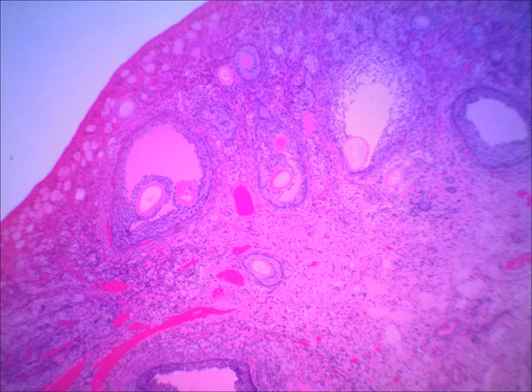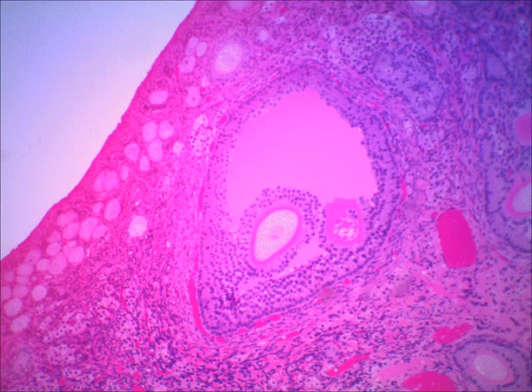The most mature of all of these follicles that you see here would be, let me erase that, I'm sorry, would be this one. All right, so that's a maturing follicle. Sometimes that's known as a Graafian follicle, capital G. That's a Graafian follicle or mature follicle, and then you see the little immature ovum inside of that. Now, my next slide is the same one on a little bit higher power, and here you can see the ovum or secondary oocyte in the middle of this maturing follicle.